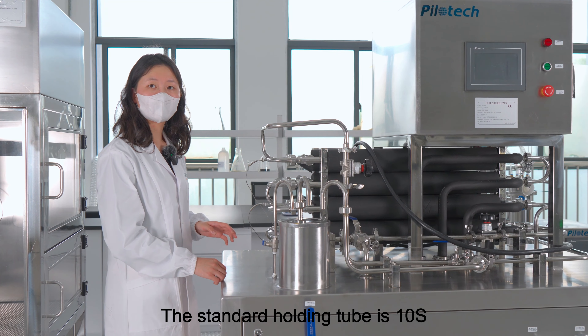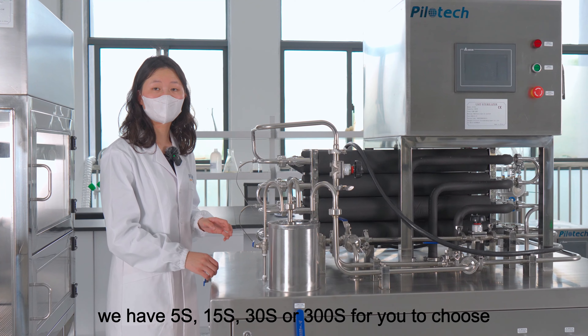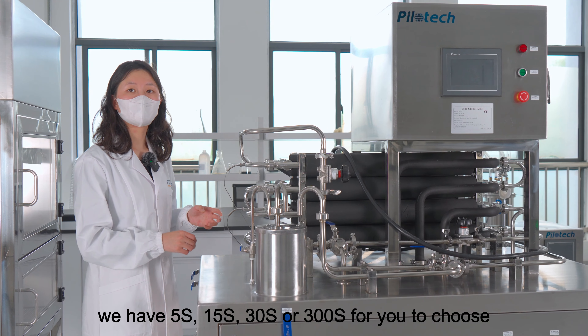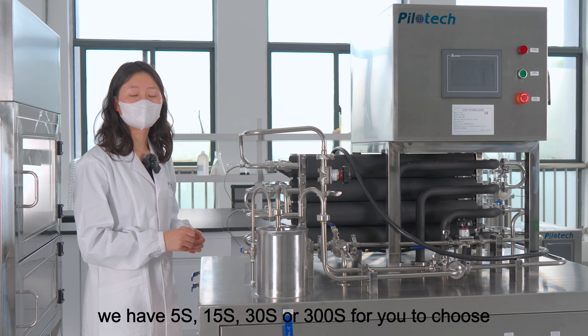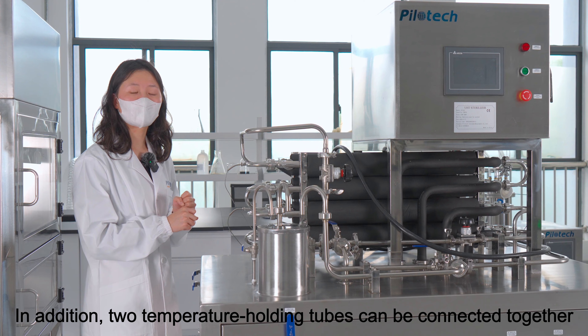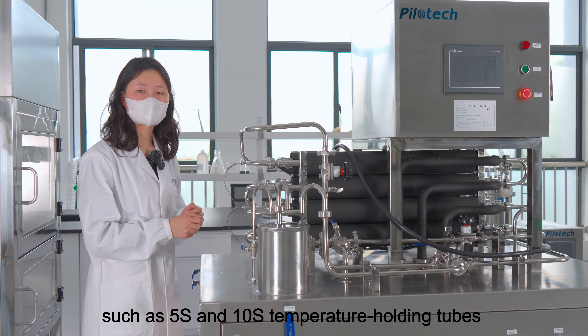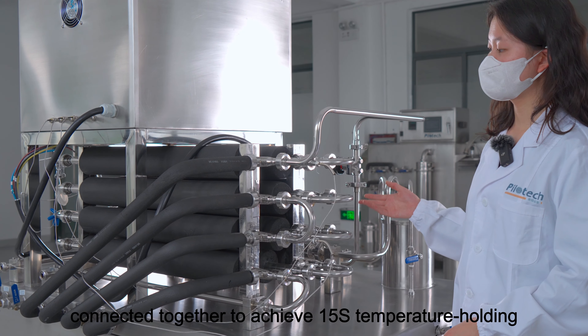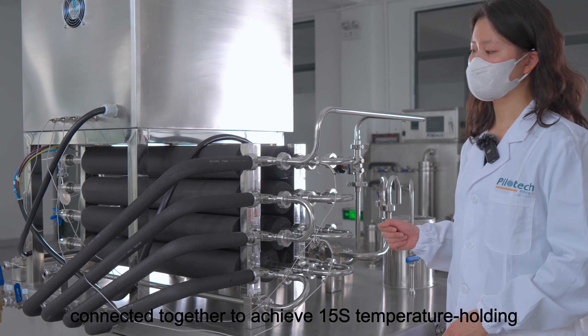The standard holding tube is 10 seconds. We have 5 seconds, 15 seconds, 30 seconds, or 300 seconds for you to choose. In addition, two temperature holding tubes can be connected together, such as 5 seconds and 10 seconds holding tubes connected together to achieve 15 seconds of temperature holding.